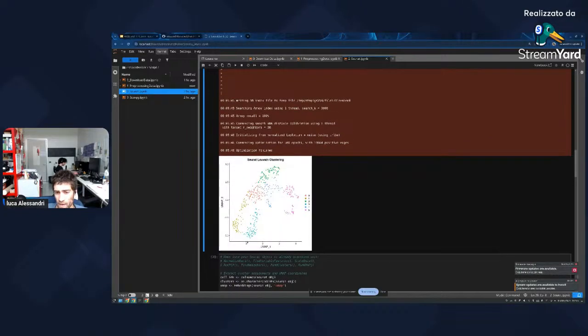It is like dividing our cells, and you can explore this data a bit better. You can check why this cell that should belong to cluster 5 actually belongs to cluster 3. The same for this one that belongs to cluster 4. We can ask so many questions, and then we can dig into the data.